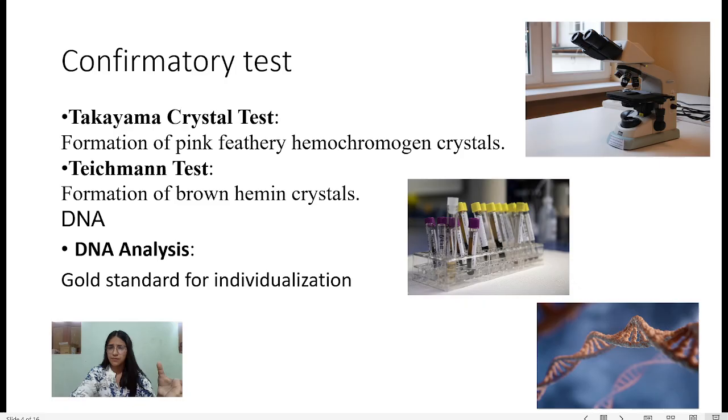The significance is that it can be used for old and degraded stains also. So this is an important test. The Takayama test is the most reliable confirmatory test for blood in forensic science.